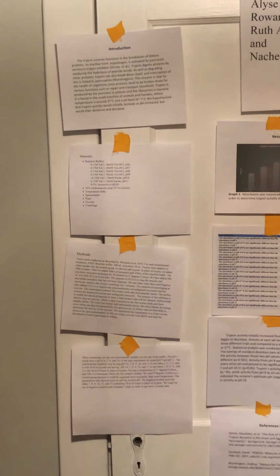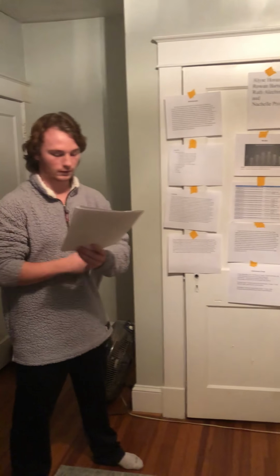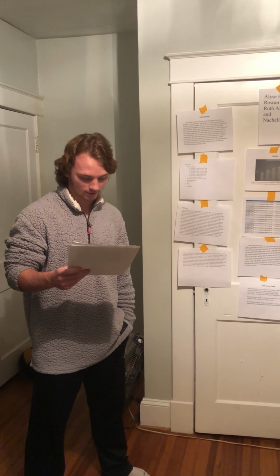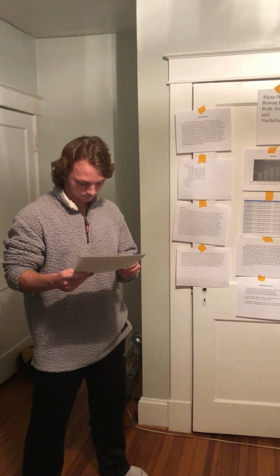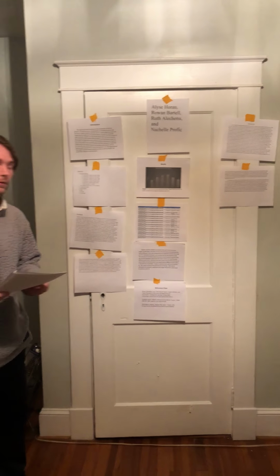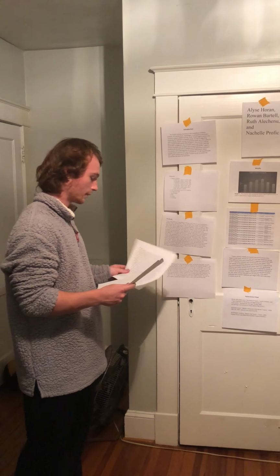Having a temperature of 37 degrees and 500 microliters of azocasein were our control variables. The 37 degrees regulated our trypsin activity. The temperature also showed enzyme activity at each pH. We used a set of negative controls and completed 3 trials in order to obtain more accurate data.